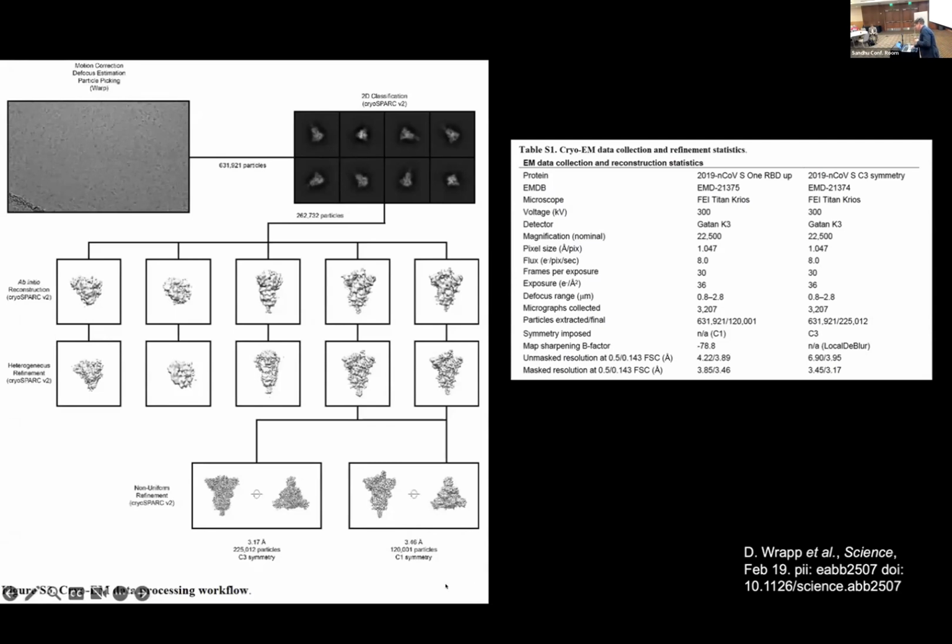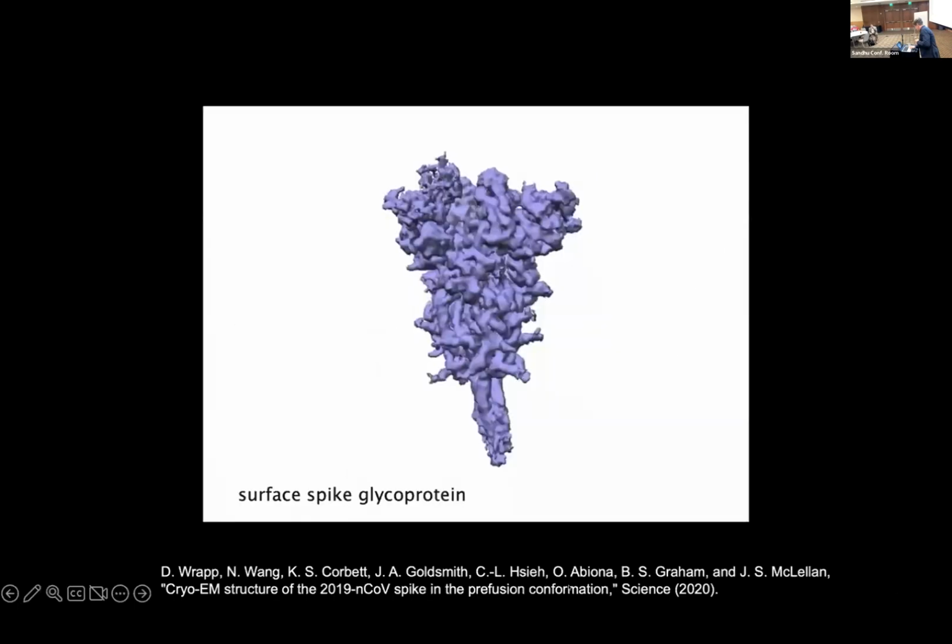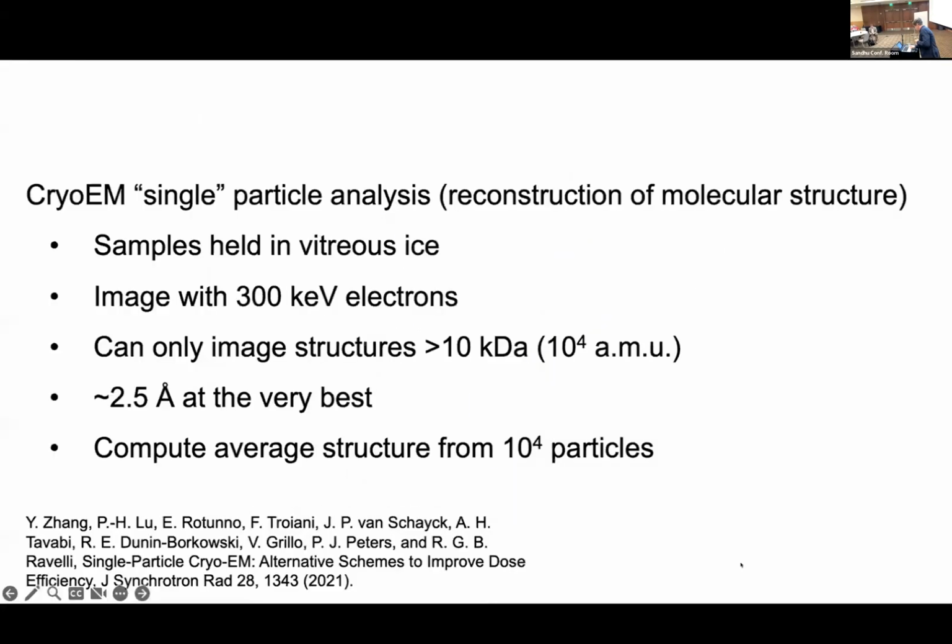Okay, so I don't do this. I'm not a cryo electron microscopist. We'll talk a little bit about what's under these things. So you have to hold this in vitreous ice for one thing. So you have to keep it cold. You're now imaging these very delicate objects. So a biomolecule is made of carbon and nitrogen and oxygen. And the one thing that those things, I'm not a chemist, but if I look on the periodic table, I know that it's pretty high up.